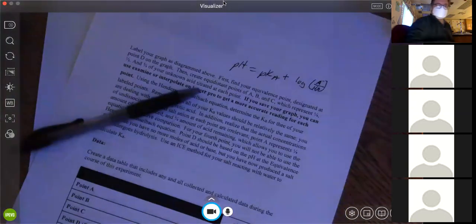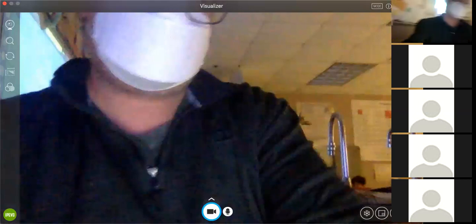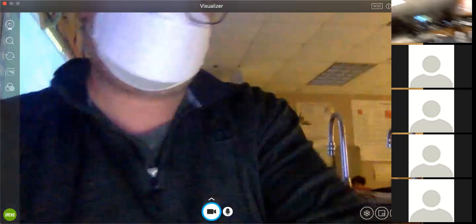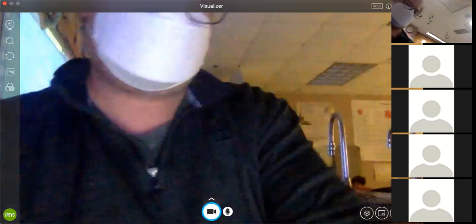All right, let's take a look then at this new device. That way we don't come in with any surprises. Same old titration setup.